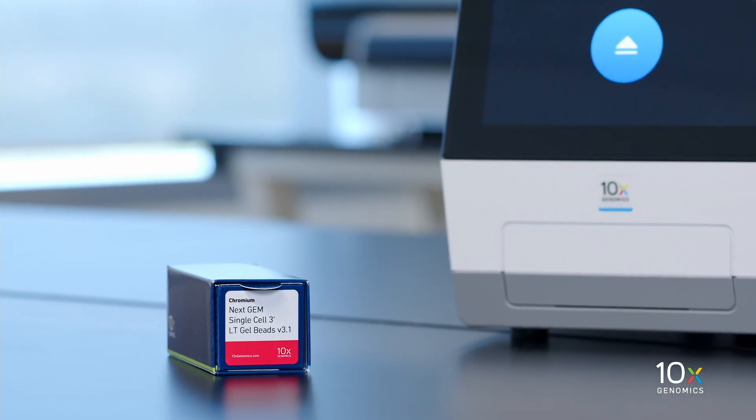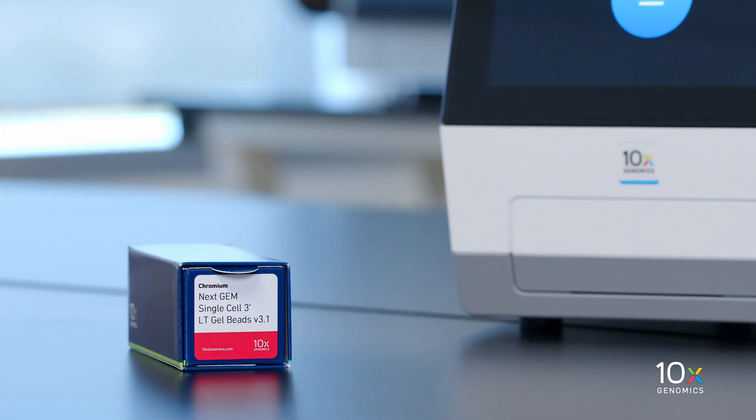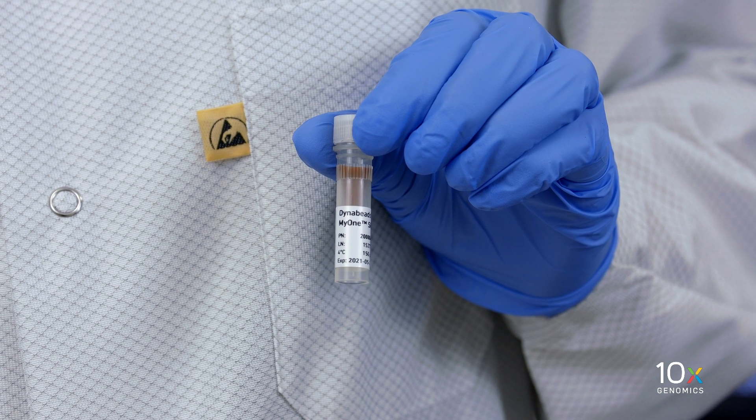The Chromium NextGem Single Cell 3' LT Gel Bead Kit V3.1 is stored at minus 80 degrees Celsius. The DynaBeads Mi1 Silane are stored at 4 degrees Celsius.